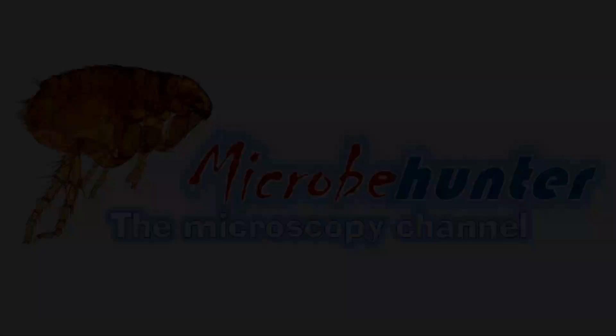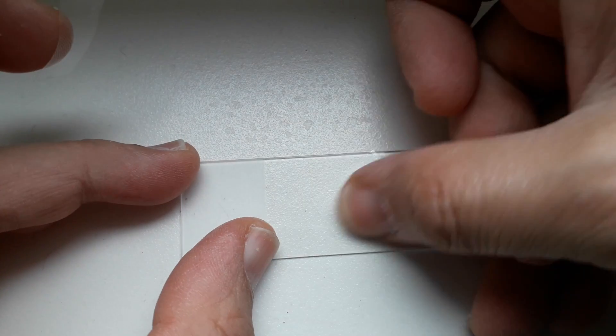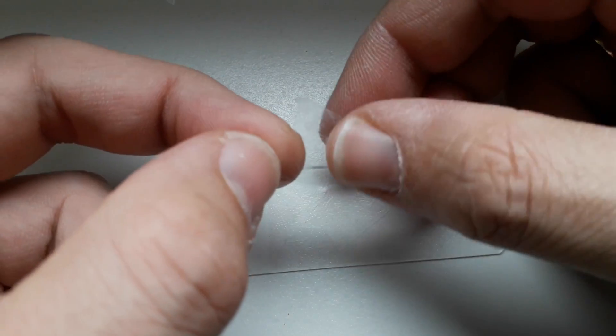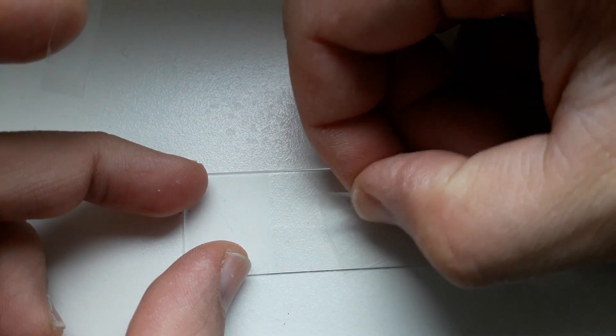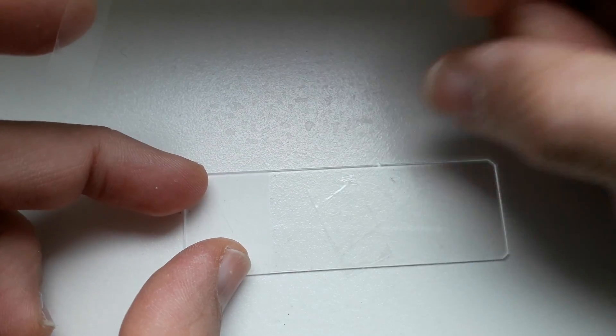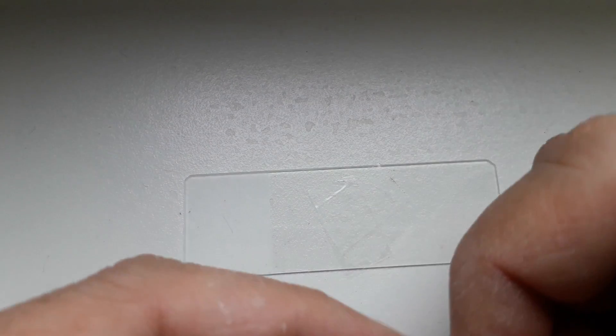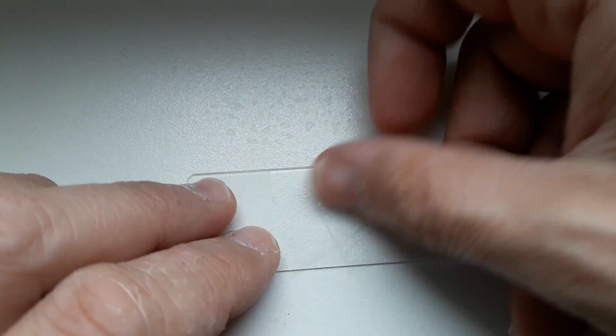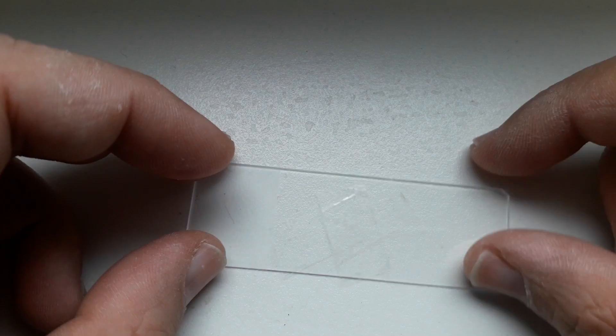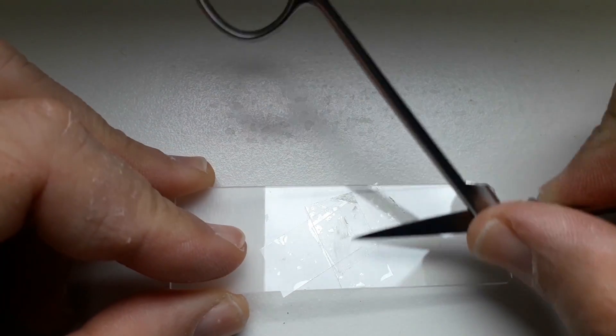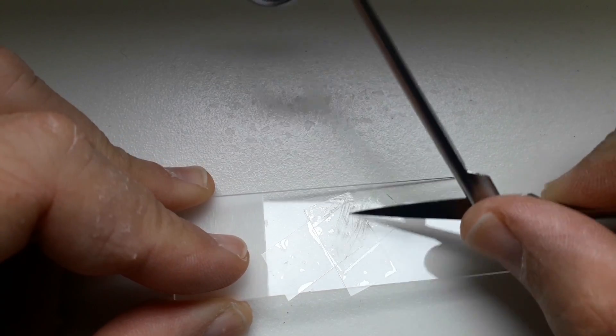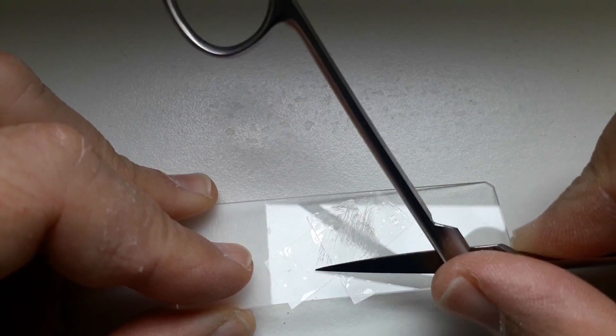Okay, a piece of sticky tape goes on the microscope slide and the second one. I want to have them overlap because this gives some interesting color effects. So in this case I simply taped three pieces on the slide, and to make everything appear a little bit more interesting I used a sharp object to scratch a pattern into the tape. It looks much nicer under the microscope then.